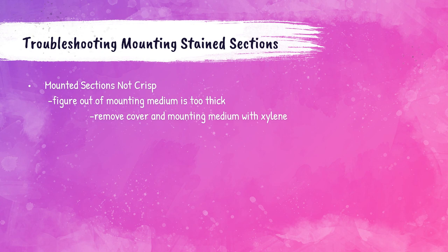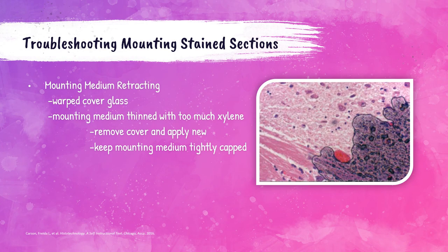If mounted sections are not crisp under the microscope, check whether the mounting medium is too thick. If so, remove the cover glass and mounting medium with xylene and remount. Sometimes the mounting medium retracts from the edge of the cover slip — as shown in the example photo with the cover slip pulling up from the lower right corner. This is most often caused by a warped cover slip or overly diluted mounting medium. To correct this, remove the cover slip and mounting medium with xylene and apply a new one. Keep the cap on the mounting medium tight to prevent dilution.